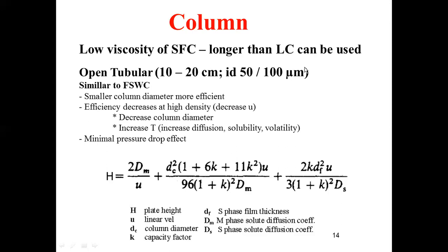There is no problem of band broadening and no reduction in the efficiency of the separation. So longer columns than in liquid chromatography can be employed in supercritical fluid chromatography separation.